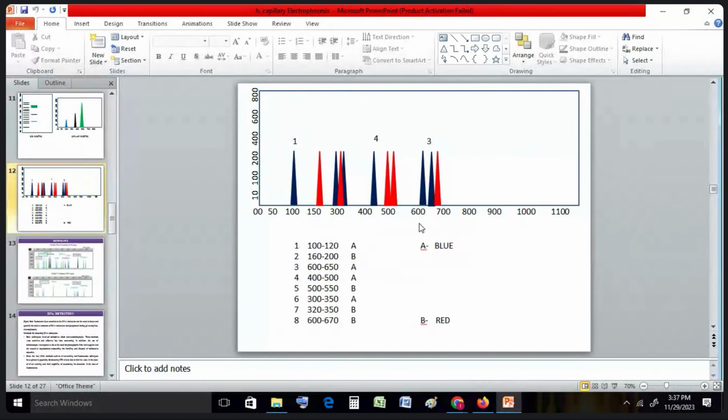You may have several different PCR results together here. When the PCR is done, the machine will represent something like this. But in your notebook or somewhere, you have the data: I am doing the PCR and this color should represent this specific locus that I have checked. For example, here you can command the software to keep all the red peaks and remove the rest with a single command, so that you can understand.